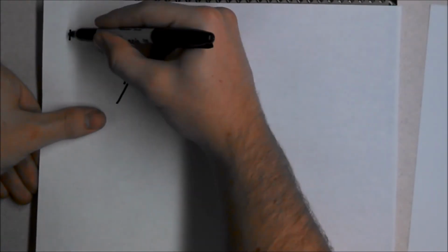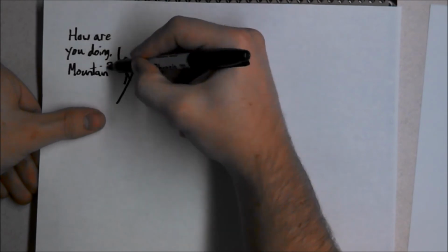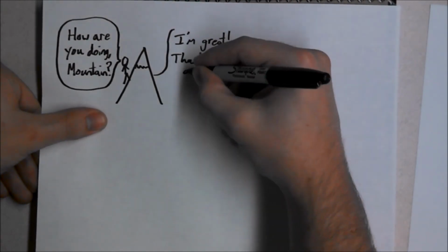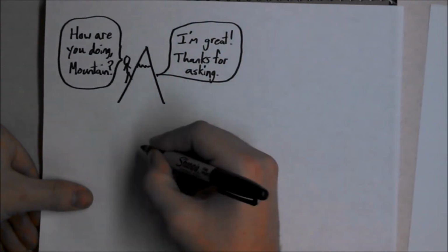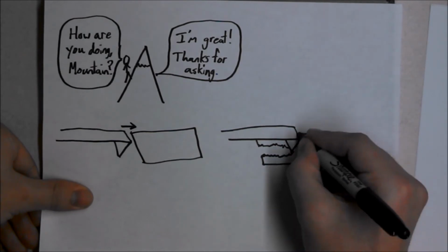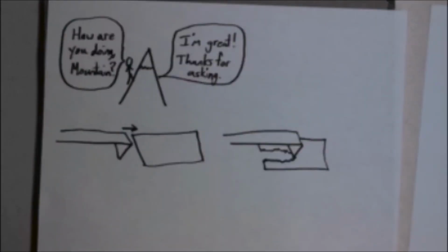So when you walk along a mountain range, you don't actually hurt the mountain at all. It's pretty much just fine, and it doesn't matter that you're measuring it. But if you're using an AFM, the sample can actually be quite sensitive to the cantilever and can be damaged, much like dragging a shovel behind you as you walk through the sand.